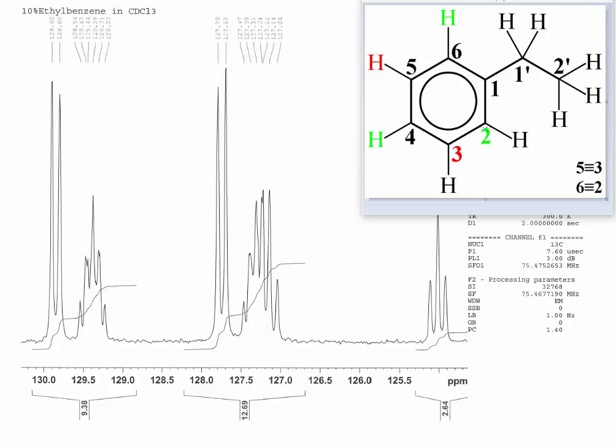The carbon labeled at 2 would be split by the hydrogen at 6 and 4. But also it would be split, and I missed this last time, maybe someone caught me on this, but it would also be split by the hydrogens of the first carbon in the ethyl group. Because that also is three bonds away. So that's why, in fact, the carbon at 2 was the second from the left in the original because it's now split into a quintet, a doublet of quintets. Finally, carbon 4 is the doublet of triplets as I described earlier.